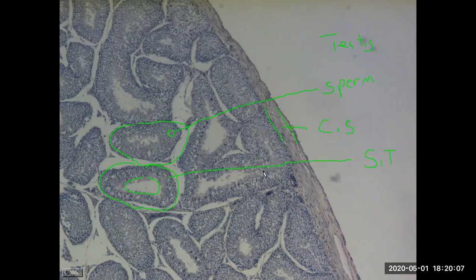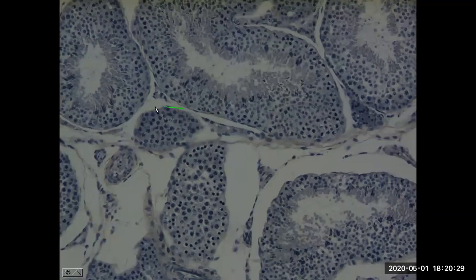Whereas now interstitial cells are found surrounding the seminiferous tubules. And we're just looking for these little enclosed clusters of cells. And these are known as interstitial cells or Leydig cells. And we'll have a closer look. So here's now a closer look on a cluster of interstitial cells, where we see the enclosed cluster, whereas the open ring, this is the seminiferous tubule, and we can see the developing sperm cells represented by the nuclei of the cell. They're in the wall, and sperm cells also move into the lumen of the seminiferous tubules.